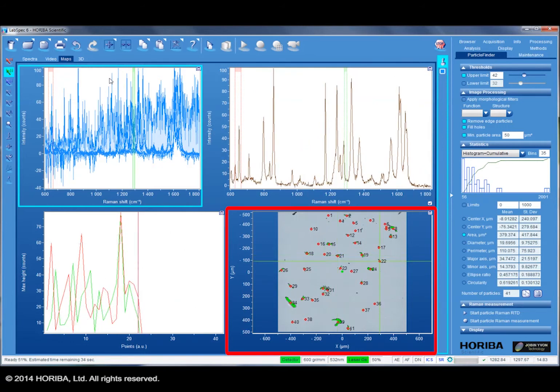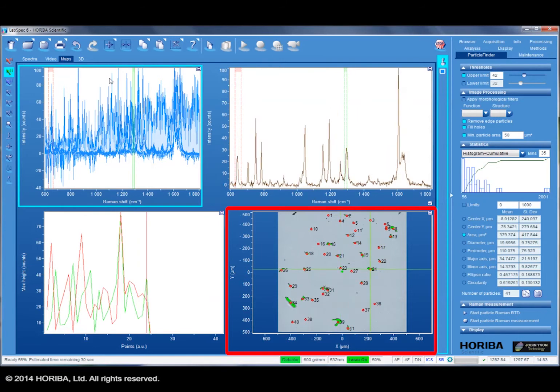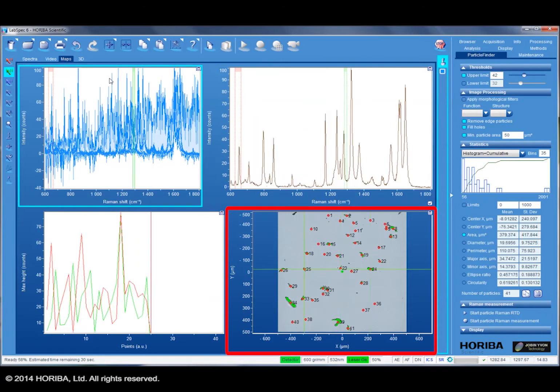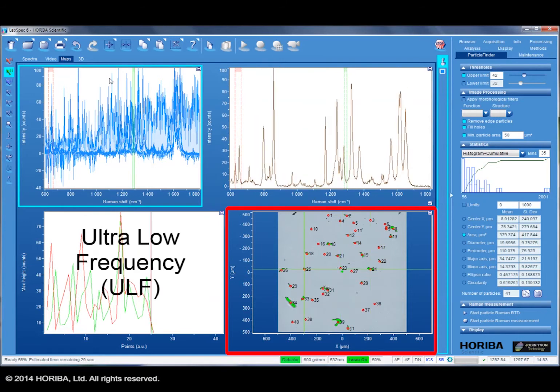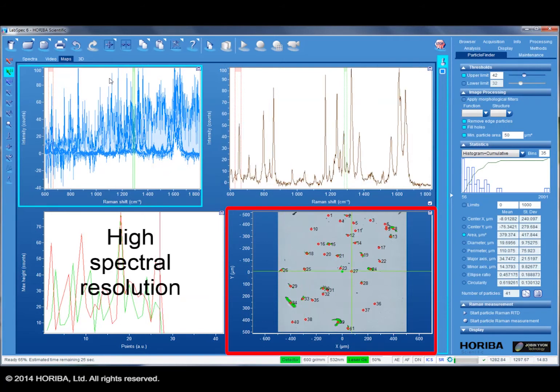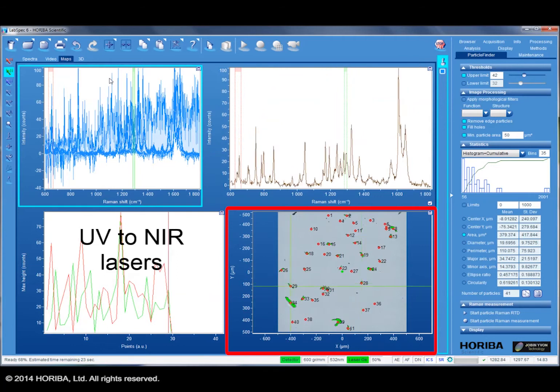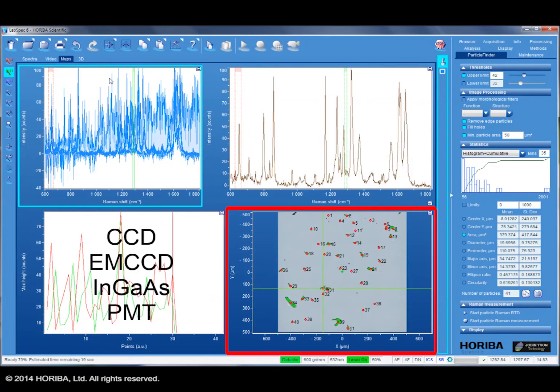All of the powerful functionality of HORIBA's Raman systems can be used with Particle Finder, including the ultra-low frequency module, high spectral resolution, a wide range of laser wavelengths from UV to near-IR, and both array and single-channel detectors.